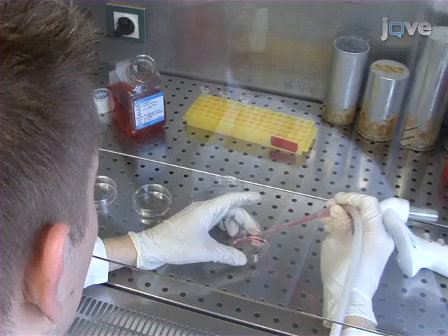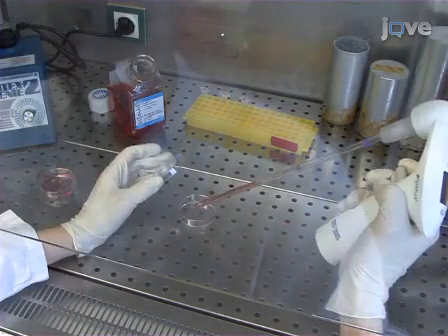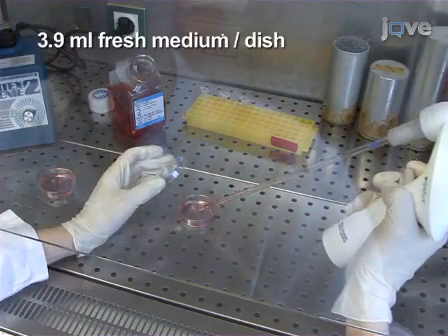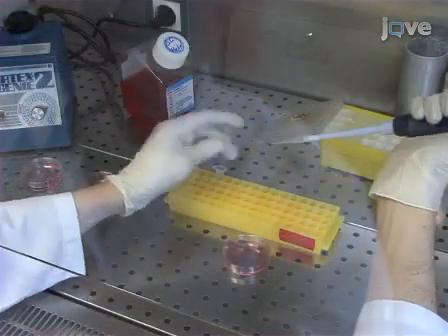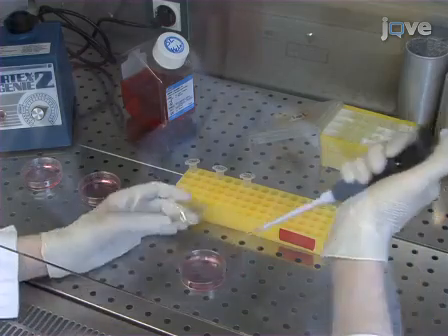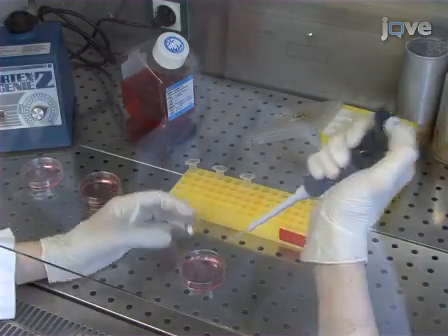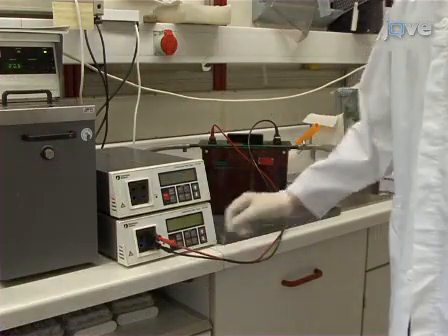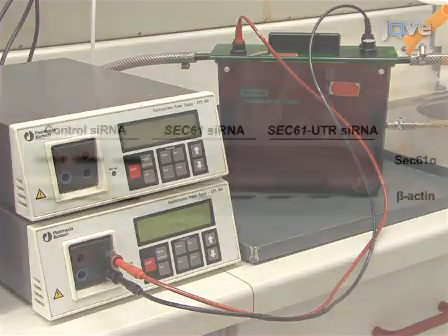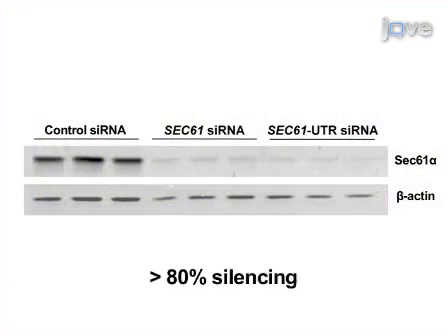After 24 hours, replace the medium with 3.9 milliliters of fresh medium. Then, to increase transfection efficiency, perform the transfection a second time using the same siRNA mix. To evaluate silencing, perform Western blot analysis. Silencing should be above 80% as shown here. For Sec61A1, the maximum silencing effect is typically seen 96 hours after the first transfection.